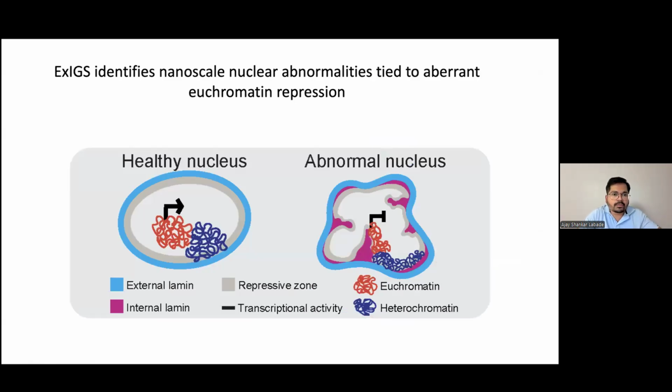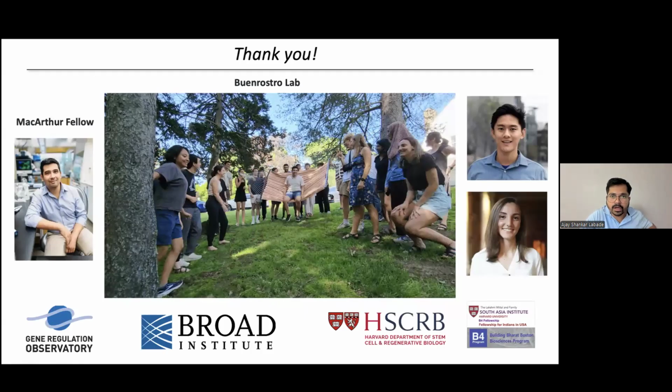With this, we have come up with a model with a very high resolution technique that allows us to look at extremely small scale changes in the chromatin. Currently, we focused in this paper on lamin, but in future, we can in fact look at other small nuclear architecture proteins, or we can also look at other disruptions in the domains of euchromatin and heterochromatin and look at a specific DNA that is inhibited or disturbed, or we can look at the transcriptional activity of that particular chromatin with this technique. And with this, I would like to conclude.